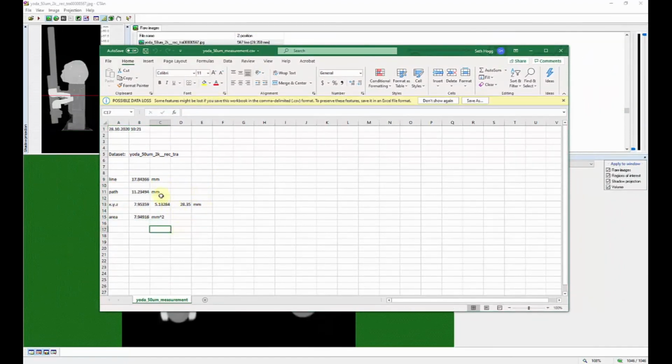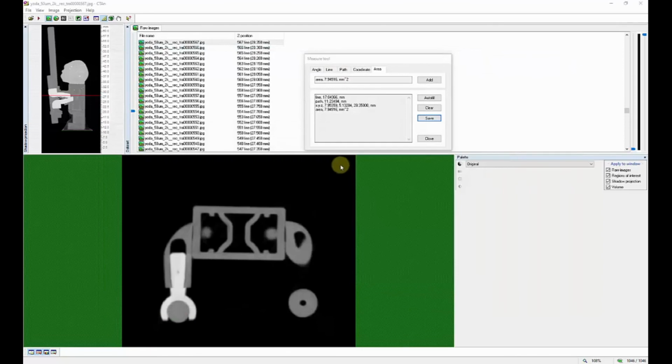Now, of course, as I mentioned, there are no context data provided with this. So it's just going to be an exact capture of each measurement and the type of measurement that was used to capture it. So that's why it's important to take notes. So hopefully you can see how you might be able to use the measurement tool with your work.